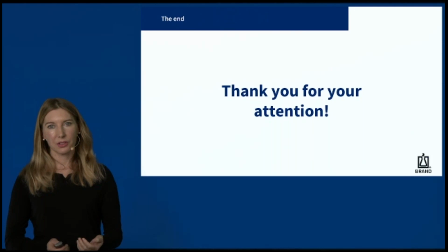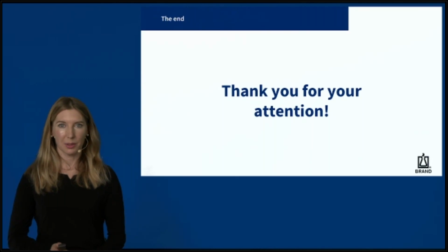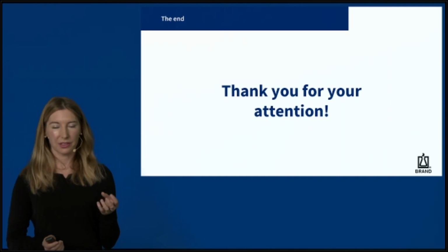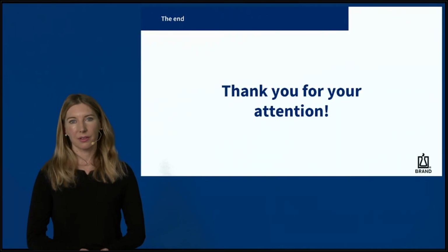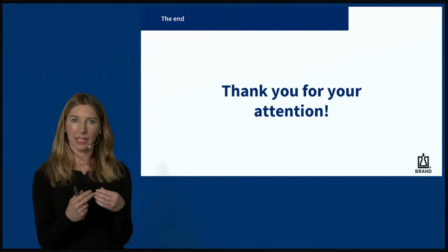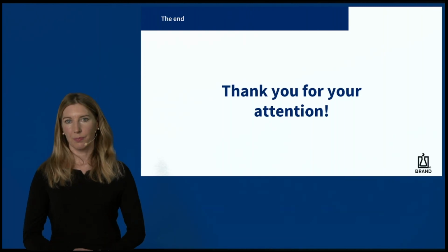Therefore, if you send your pipettes to a calibration service, then please make sure that you also send your third-party tips with your pipette so that the service can check if the tip and the pipette match, if it is a matching system. Because if the tip cone and the tip do not fit perfectly, there is a leakage in the system. And if you have a leakage, then you do not dispense the right volume.